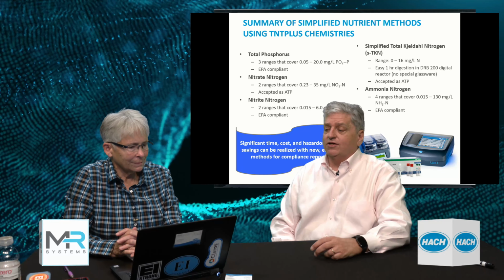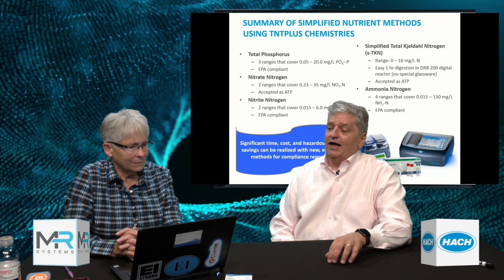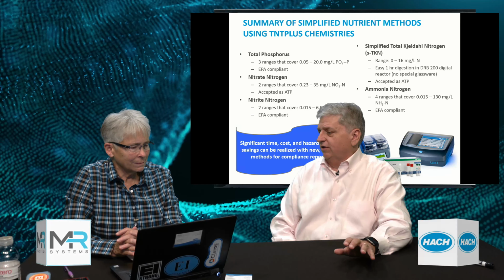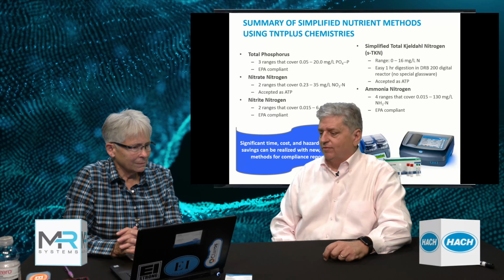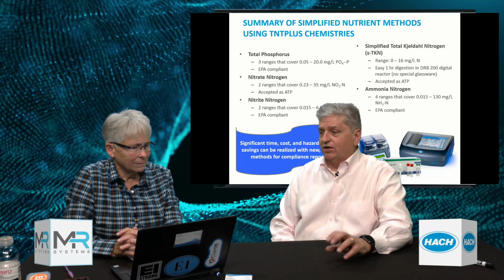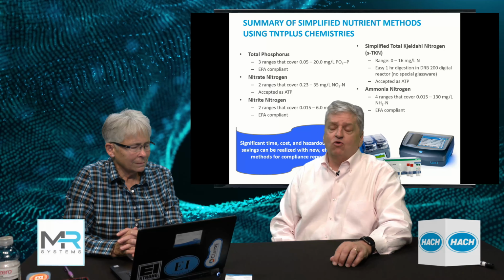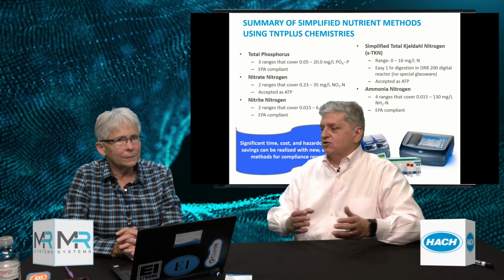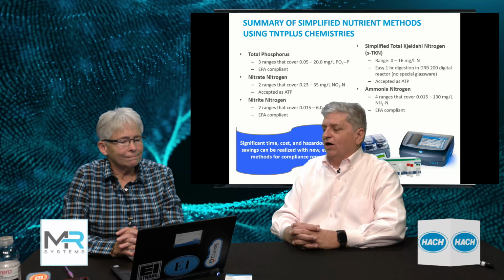So it is great to actually be using the real values that are driving the nutrient removal through the biological means, and not just look at a derivative, because these will react much quicker than dissolved oxygen or even alkalinity or something like that, which is a trailing factor.